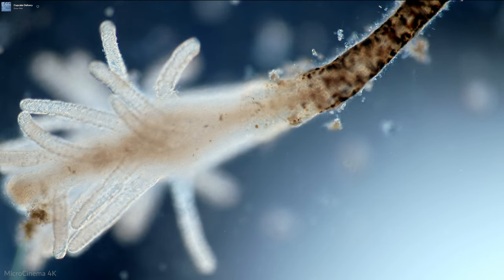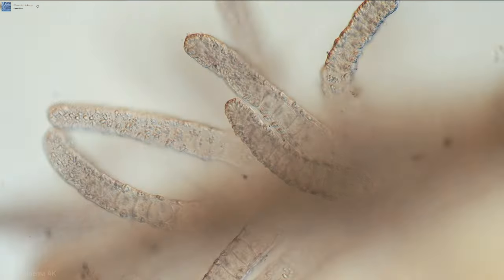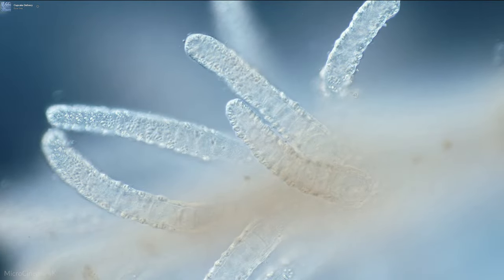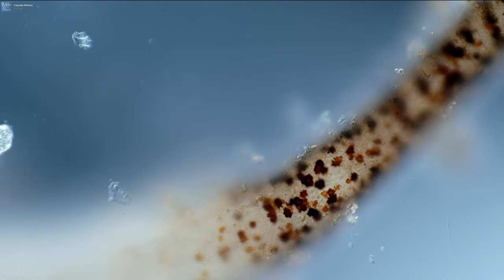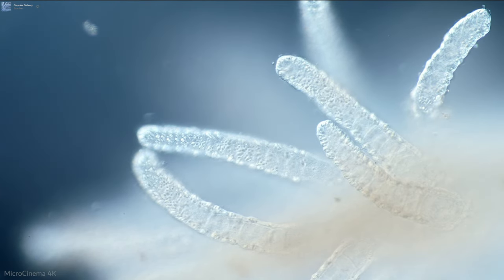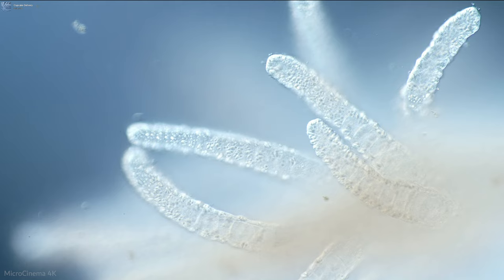So is this like a coral or something? I honestly have no idea. Look at this thing. And it doesn't contract. I had to basically cut off a little section of this to get it onto the slide, and in that whole time, it didn't really seem to react to me or anything, and it doesn't have cilia like a bryozoan would. I don't even know if I see stinging cells or anything, but this has to be an animal, right?